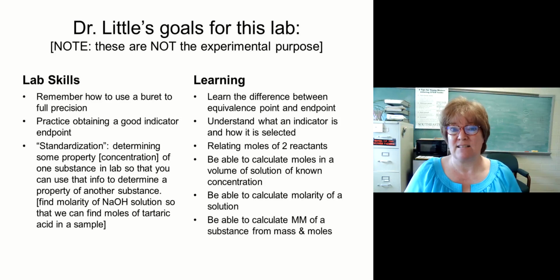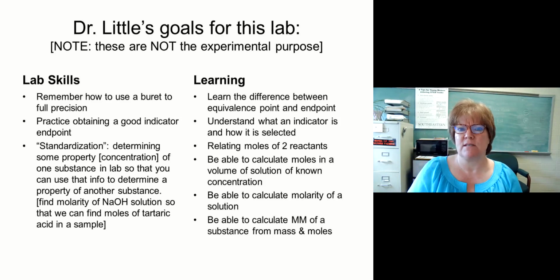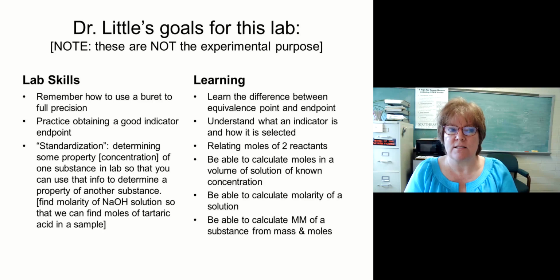In particular, acids and bases. One, they can evaporate to some extent if they're not really well sealed, but also the chemicals themselves can react and oxidize and kind of change slightly over time. They can decay. So I don't know what the accurate concentration is unless I measure it.